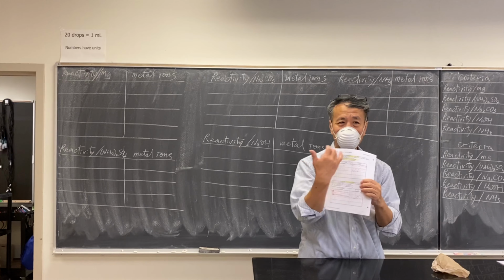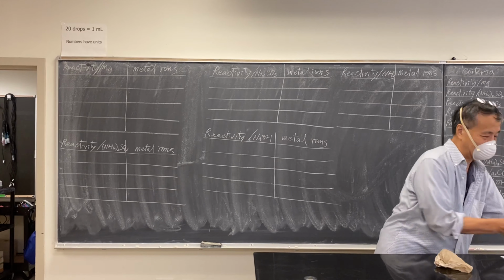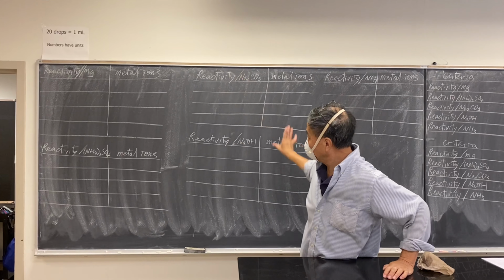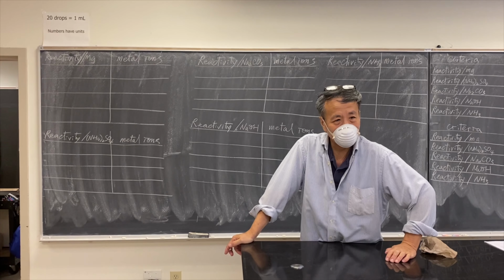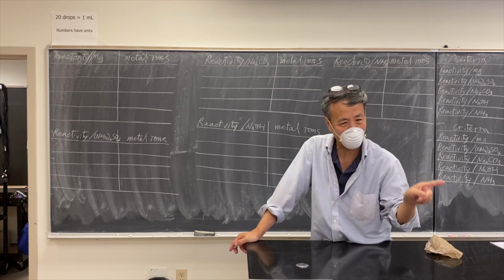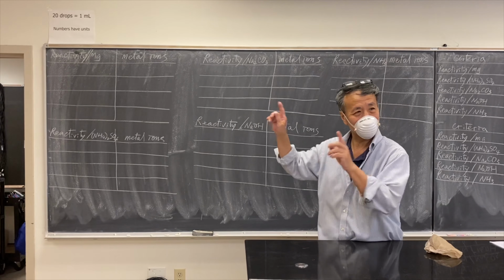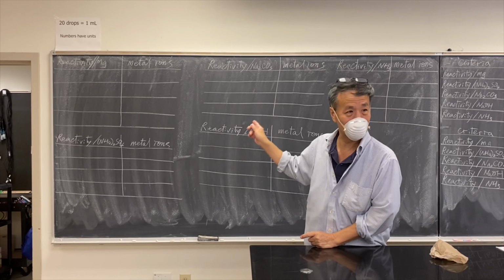You will see on top of each table, we ask the student, in italics and all capital letters, to group your ions and then group your finished product mutually exclusive. Simply, in science, it means if something is in one place, it cannot be in another place simultaneously. All right, so we're going to see how this plays out during our grouping.